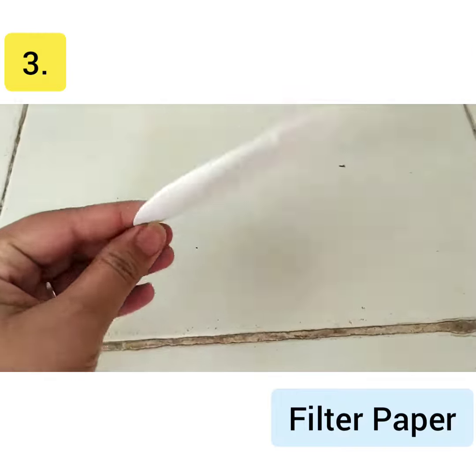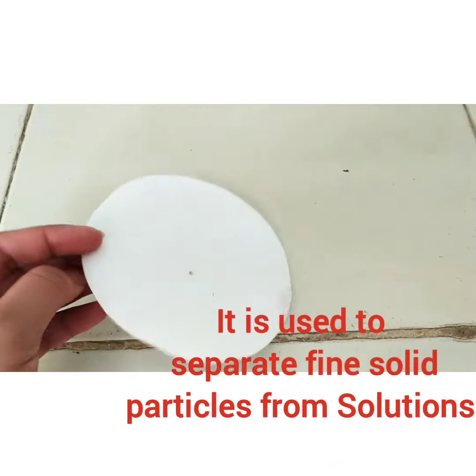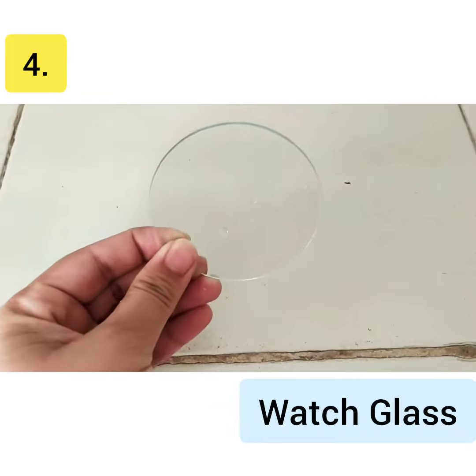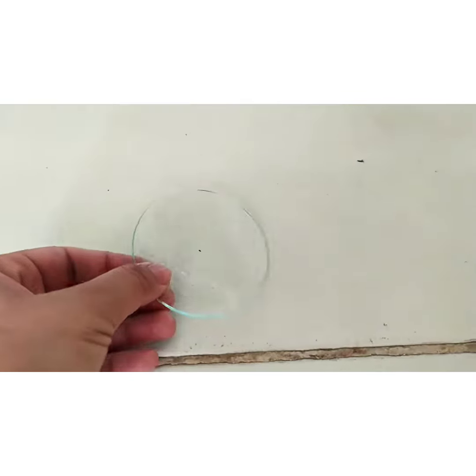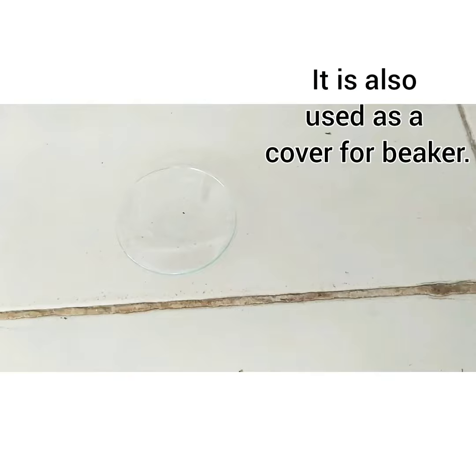Number 3. Filter paper. It is used to separate fine solid particles from solutions. Number 4. Watch glass. It is used to hold solid chemicals while being weighed. It is used as a surface to evaporate small amount of liquid. It is also used as a cover for beaker.